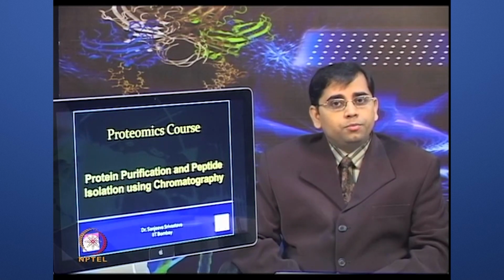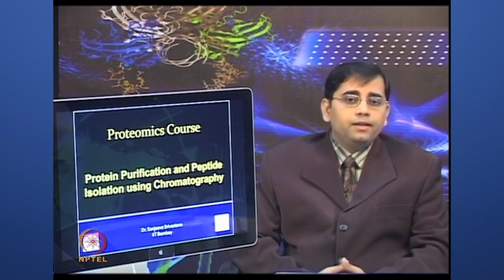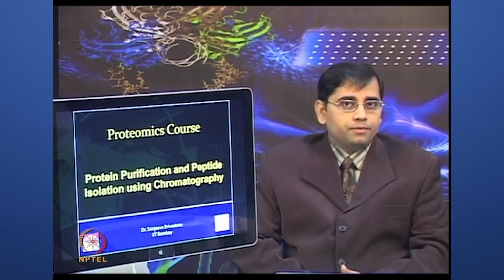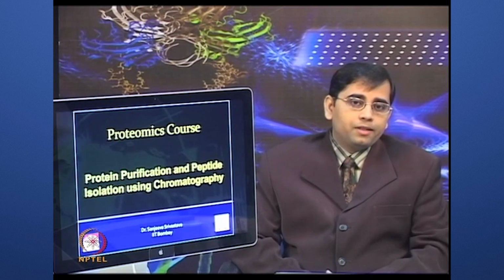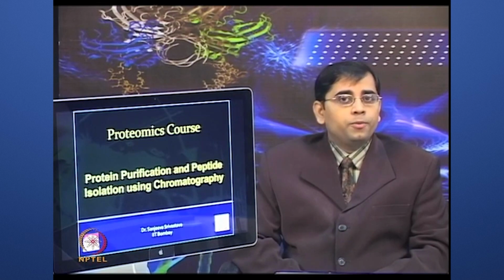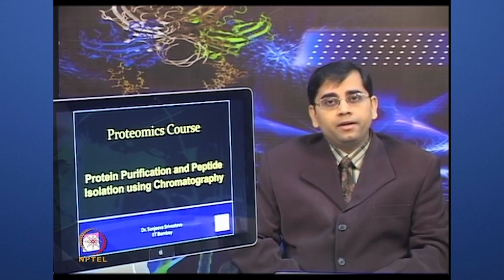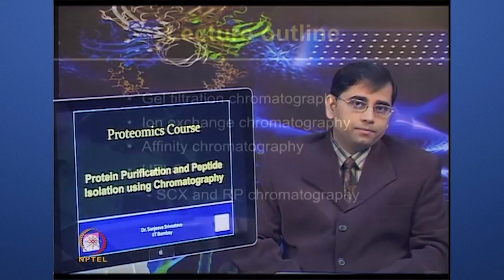From a complex proteome, it is challenging to purify a protein in a single chromatographic step. Therefore, sequential pre-fractionation steps involving different modes and types of chromatographic methods are becoming necessary for proteome level analysis.